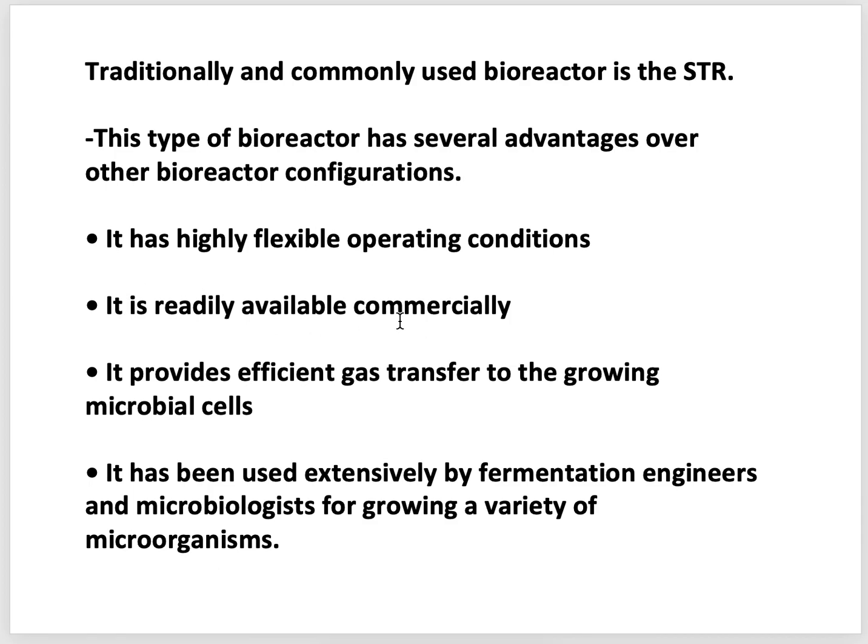It is readily available commercially, and it provides efficient gas transfer to the growing microbial cells. Mixing is best in stirred tank bioreactors. I mean, there is a problem: stirred tank bioreactors create shear forces, but mixing is best. And as the mixing is best, the gas transfer is better, that means efficient, in case of STR, stirred tank bioreactors.